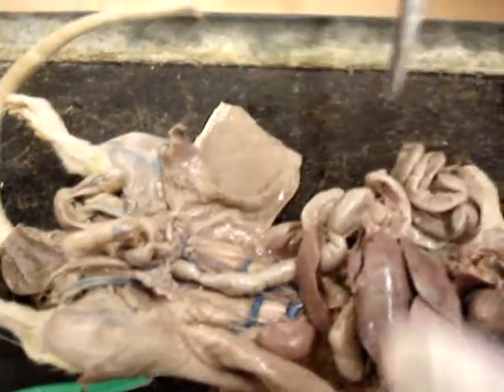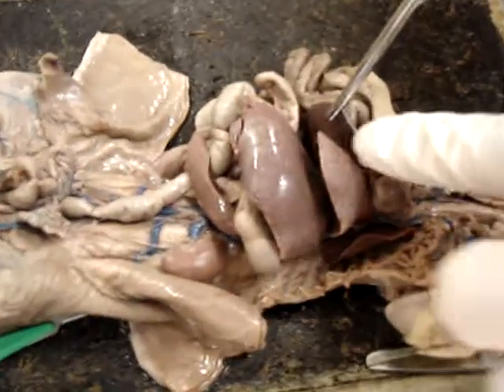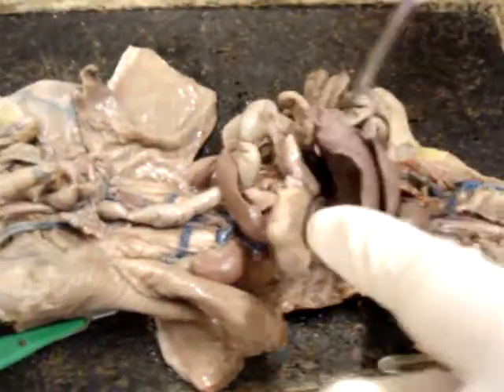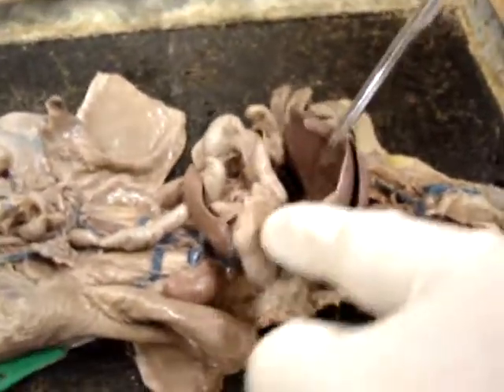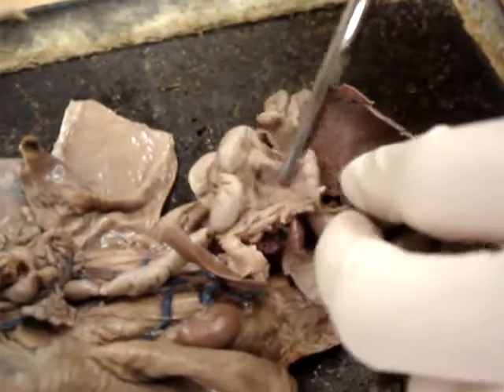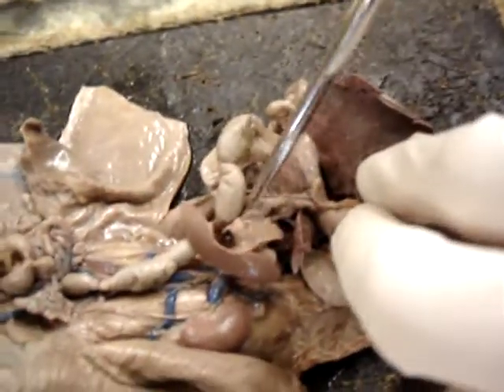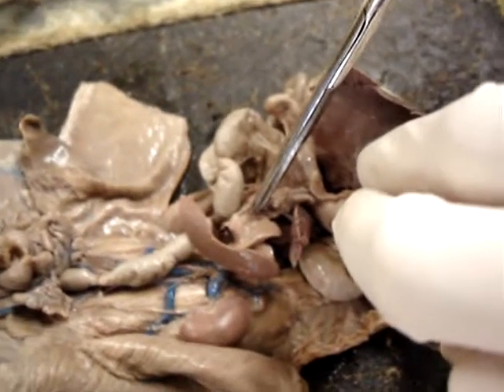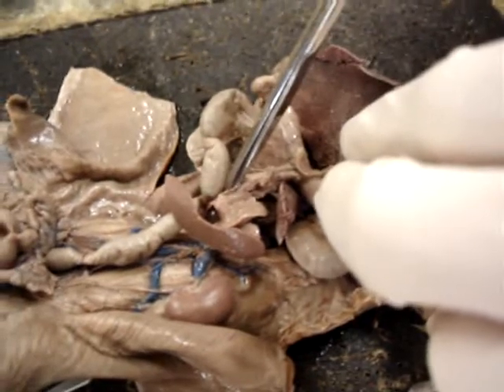The liver would be the big lobes here — three or four big lobes. Those are the liver. The pancreas would be this thin layer right here — very thin layers of tissue. That's the pancreas.